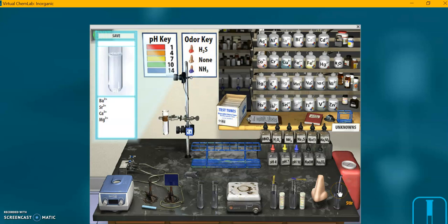And lastly, stirring. Click on that and it stirs your solution.